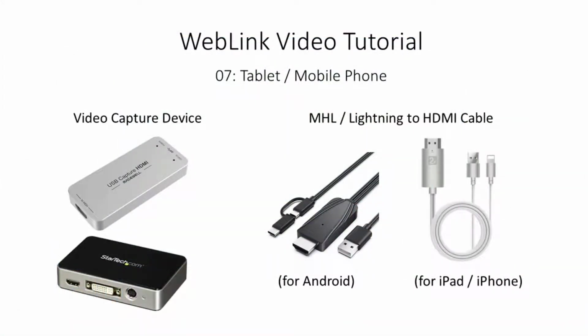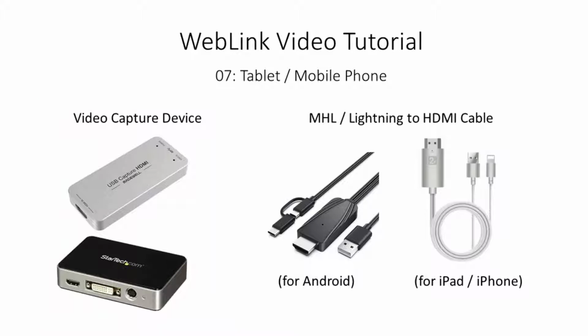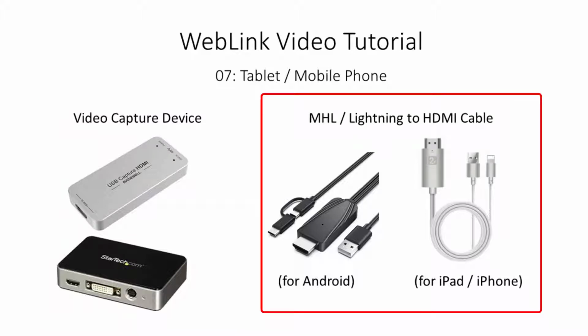To record gaze while participants interact with tablets or mobile phones, you will need a video capture device. For this project I used a relatively inexpensive StarTech device. Magewell devices also work well. You will also need an MHL or Lightning to HDMI cable.